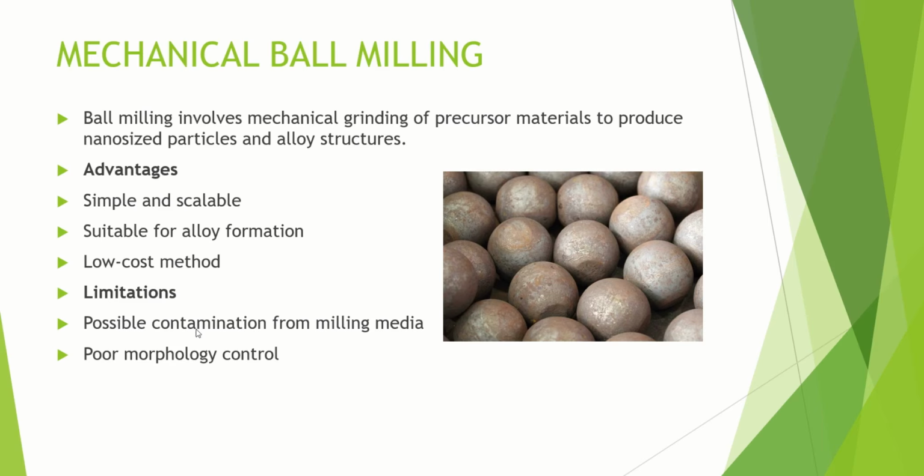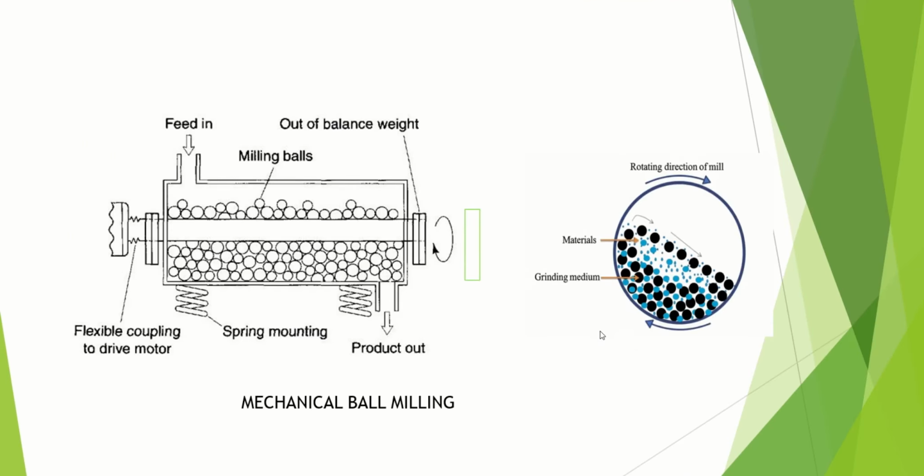It is also one of the only ways to make certain alloy nanoparticles. The trade-offs include the milling media can contaminate your sample, and you don't get as much control over the final shape and size of the particles.